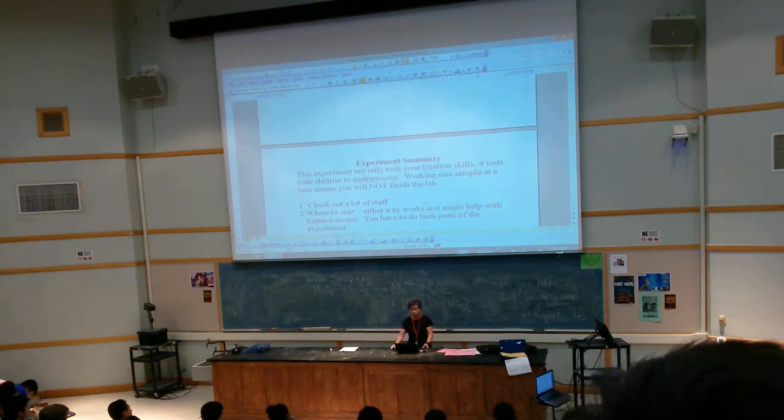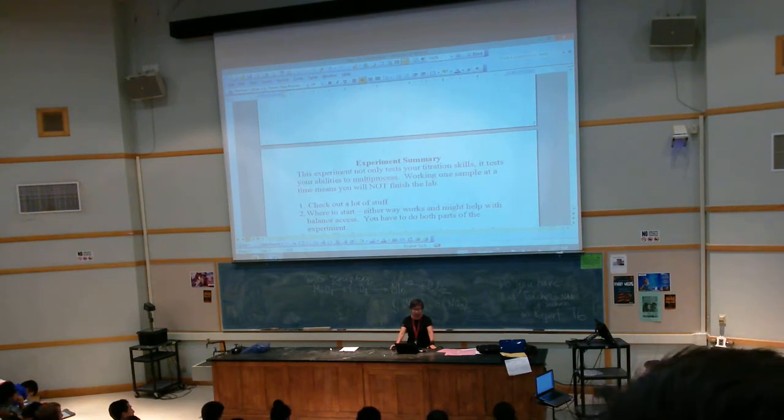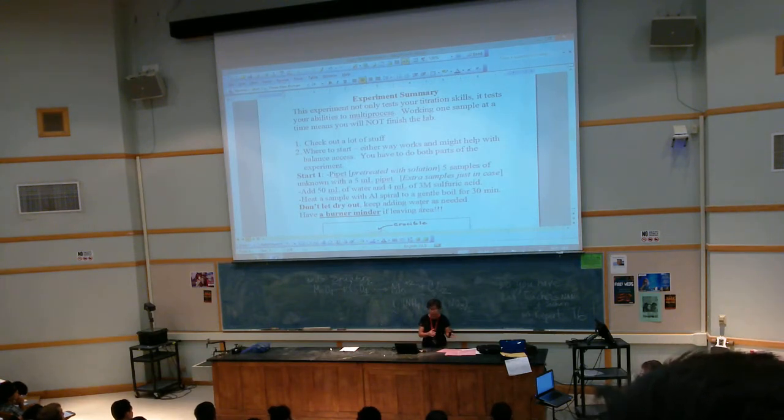Okay, so first thing, before you go in the lab, make a list of what you need to check out. You have to check out a lot of stuff, okay? So, where to start? There are two places you can start. Some of you will be weighing. Some of you can be preparing your unknown solutions so that we don't have a backup in the balance room. Are you following me so far? You can split it. It doesn't matter which part you start first. Are you following me?